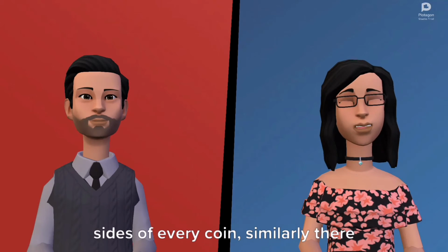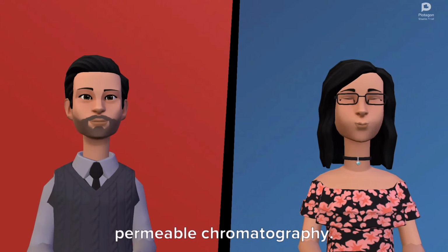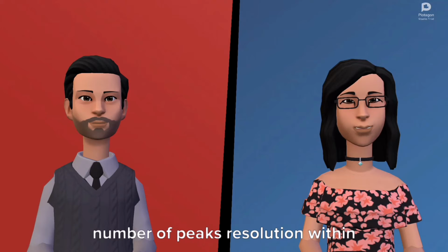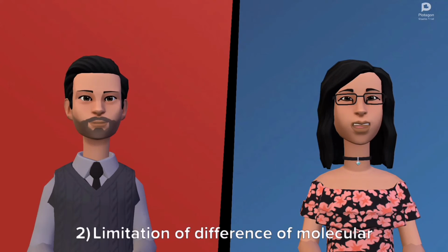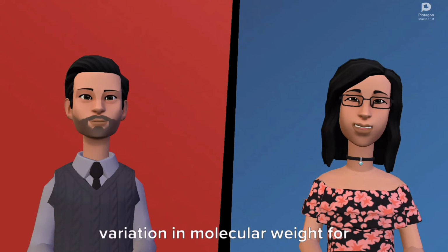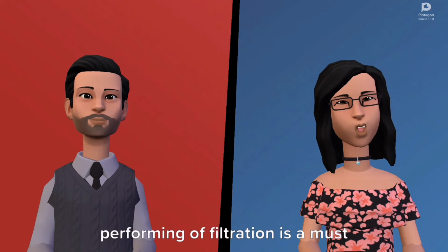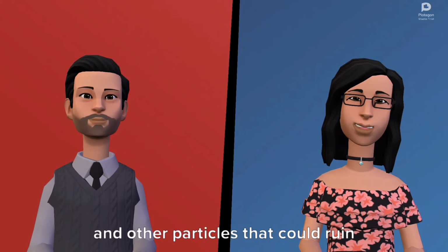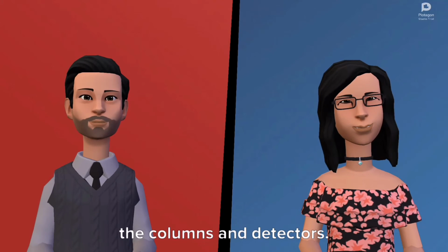Disadvantages. As there are two sides of every coin, similarly there are some disadvantages of gel permeation chromatography. Some of them are given below. 1. Limited number of peaks resolution within short period of time. 2. Limitation of difference of molecular weight, as GPC requires at least 10% variation in molecular weight for a good peak resolution. 3. Before the use of instruments, performing a filtration is a must to avoid contamination due to dust and other particles that could ruin the columns and detectors.